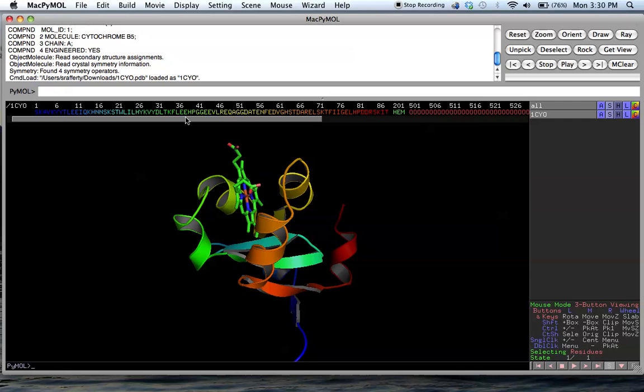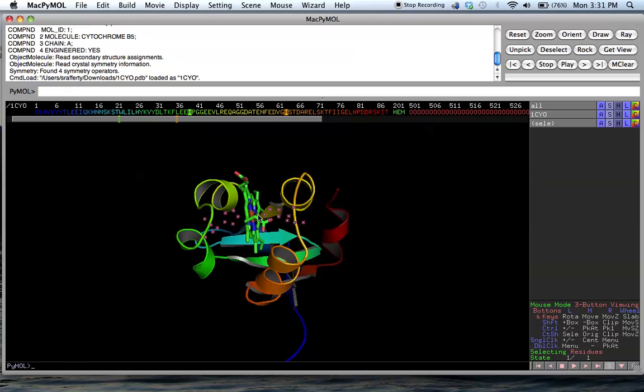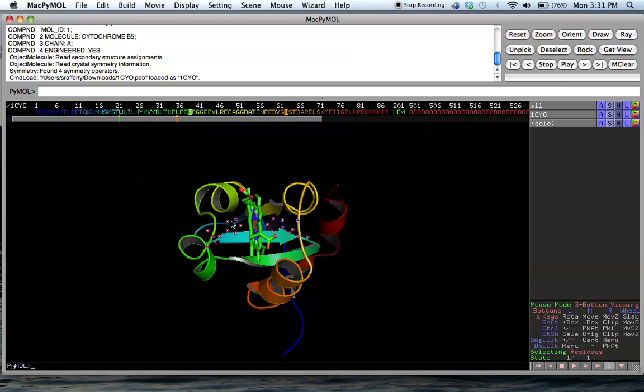So for example, we'll take this residue here, this histidine at position, I think it's 40, and another histidine residue here at position 63. You see now how they're not visible, but you can see where they are based upon these little red squares that are present. So now you also notice on the right-hand side, there's another group of things we can select.